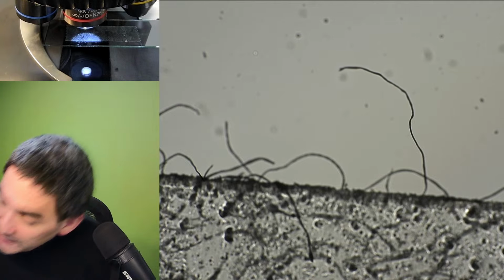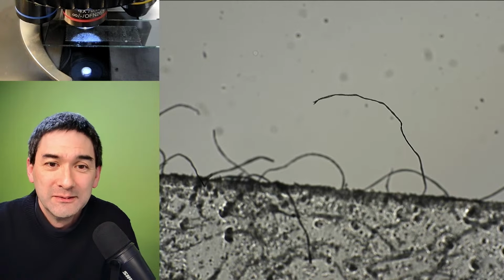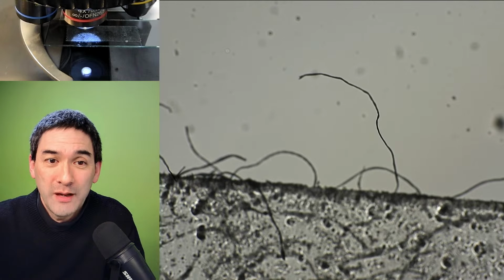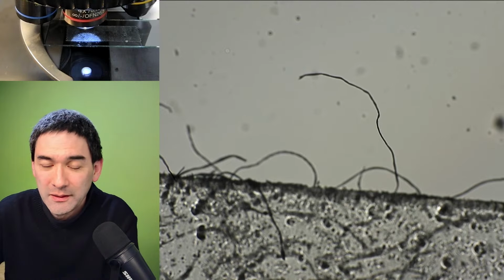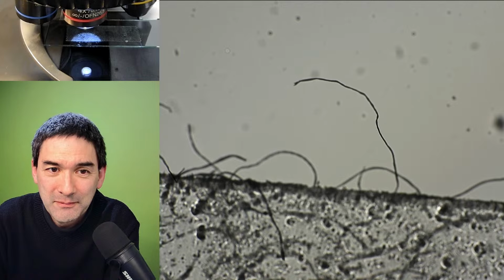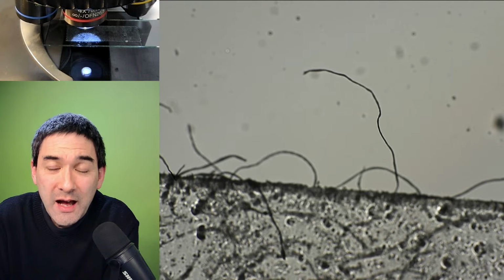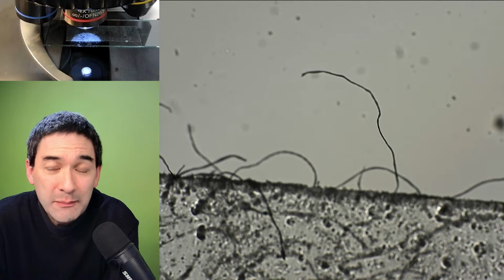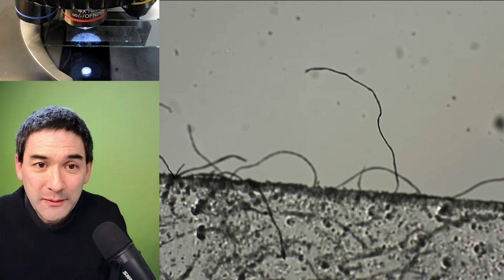Let's make the worms move again. Worms in quotation marks. See. Again, I'm not blowing at them anymore, but they keep on moving afterwards, right? Because, as I said, the moisture starts to evaporate. I answered the email a couple of years ago, and I also showed what real worms look like. Real worms look like real worms, right? And not just like these things here. Yeah, just saying.